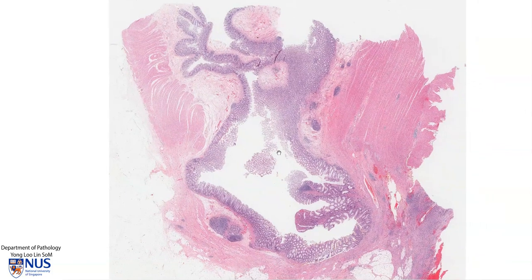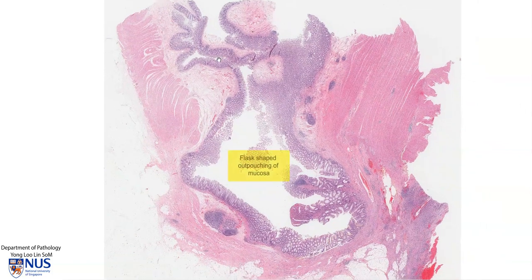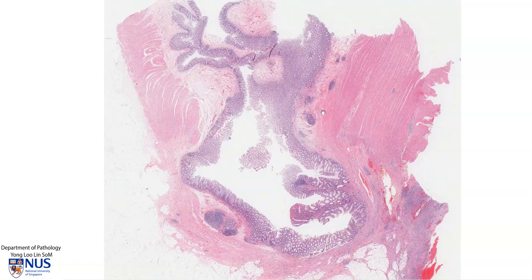Moving back on to low magnification, we can see that there is a flask-shaped outpouching of the mucosa of the large bowel into the wall, through the layers of the wall. And in fact, you can see that it kind of penetrates through the muscularis propria. And the mucosa is intact throughout this particular diverticulum.